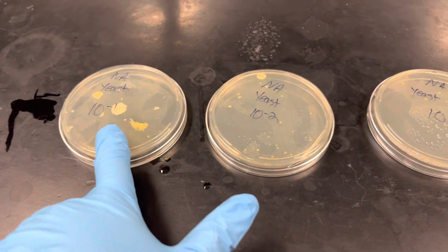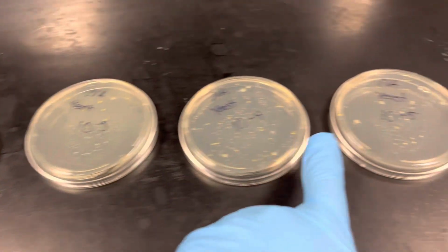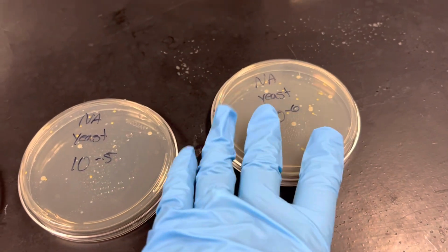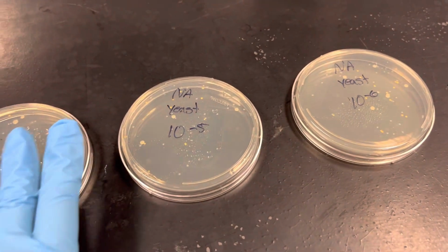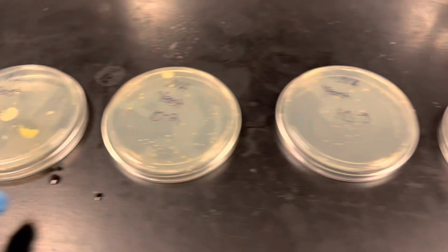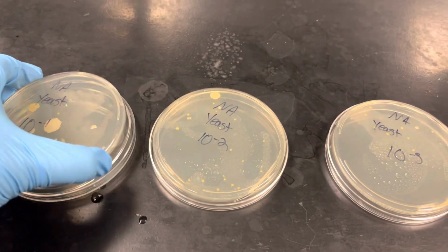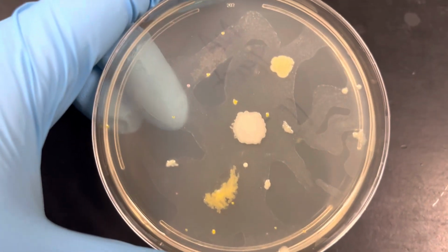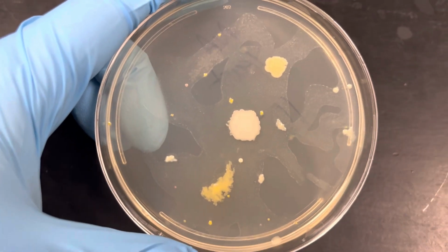So here's my -1, 10 to the -2, 3, 4, 5, 6. If you looked at the yellow colonies of bacteria, there doesn't seem to be any rhyme or reason. The yeast is actually much clearer and harder to see. So let's see if I can get a good zoom, holding my phone with one hand. So all of these big white and yellow colonies, those are bacterial colonies.